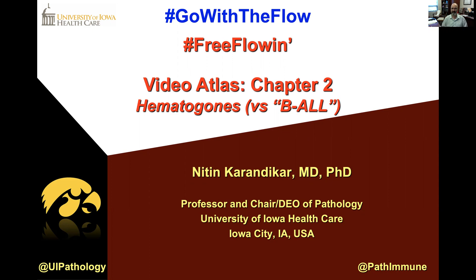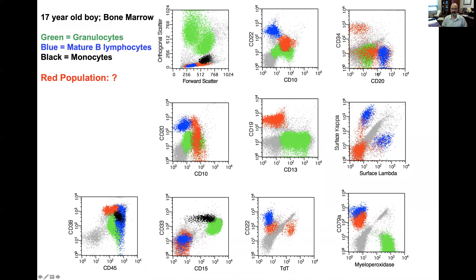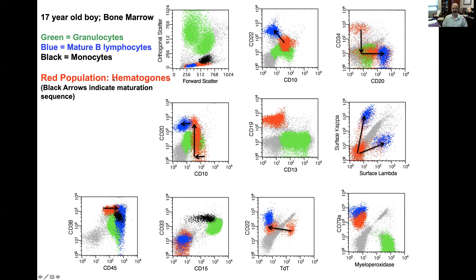To know that, we need to know what hematogones look like. This is what hematogones basically look like. This is a 17-year-old boy's bone marrow. As labeled here, the green are the granulocytes, the black cells are the monocytes. This blue population is a nice internal lymphocyte control — these are the mature B lymphocytes, nicely splitting into kappa and lambda and CD20 positive. We will focus on this red population, which is hematogones.